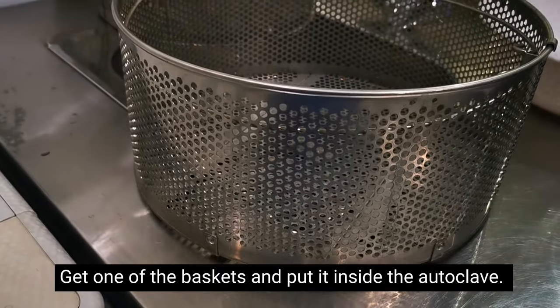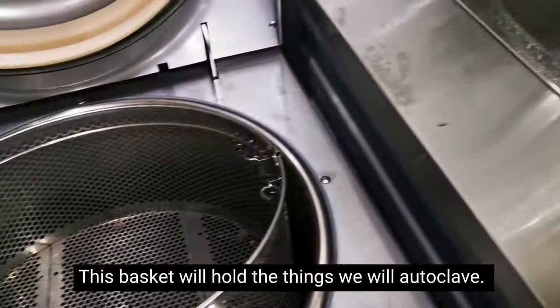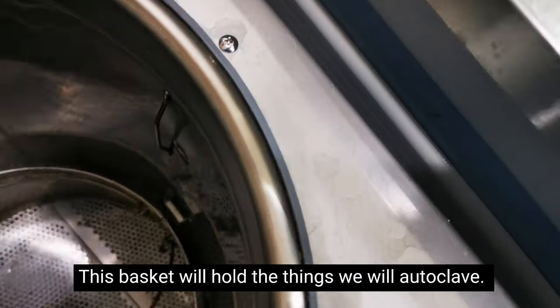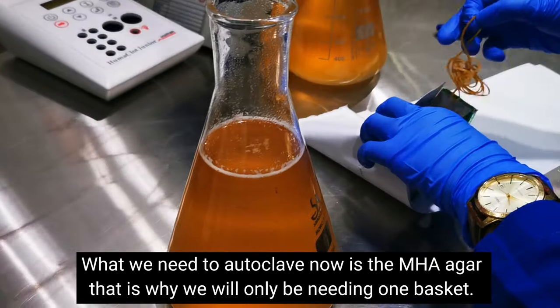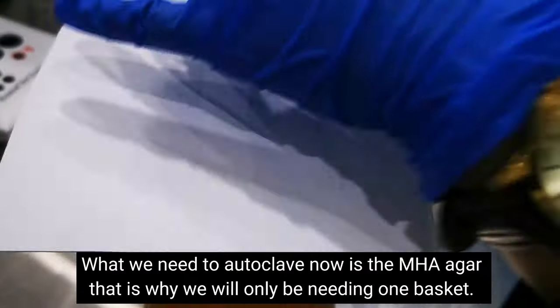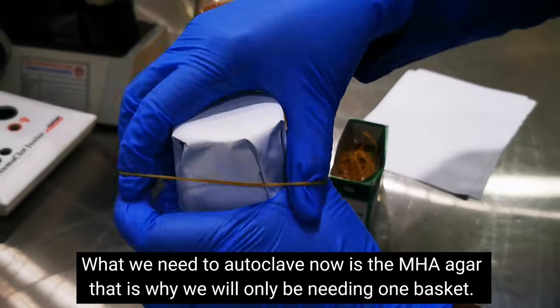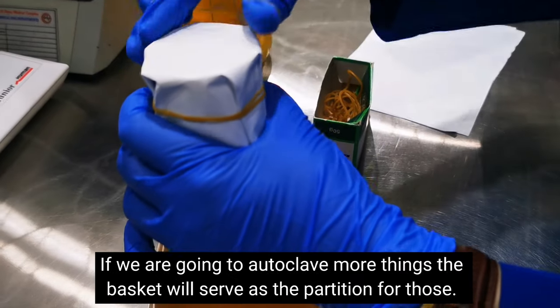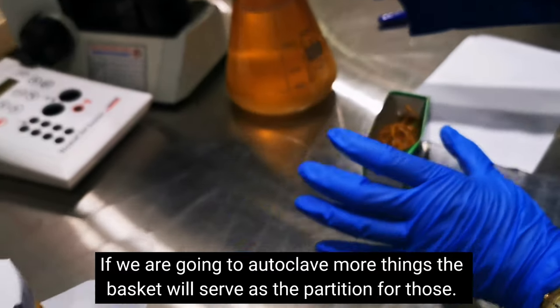Get one basket and place it inside — the basket holds the items we need to autoclave. In our case, we only need to autoclave two MHA agar in Erlenmeyer flasks, so we only need one basket. But if you have many items to autoclave, the basket will serve as the partition for everything you need to sterilize.